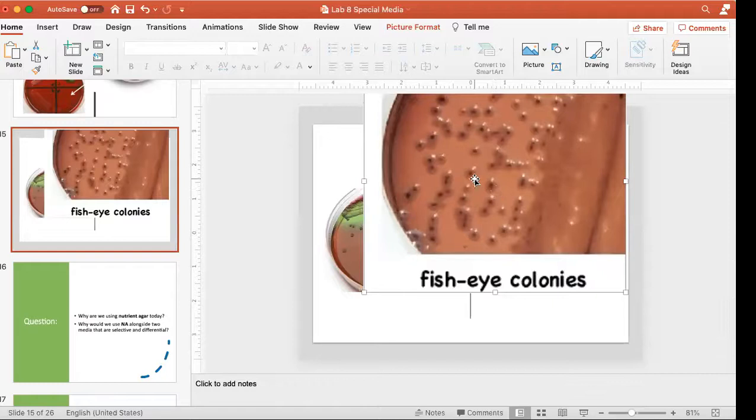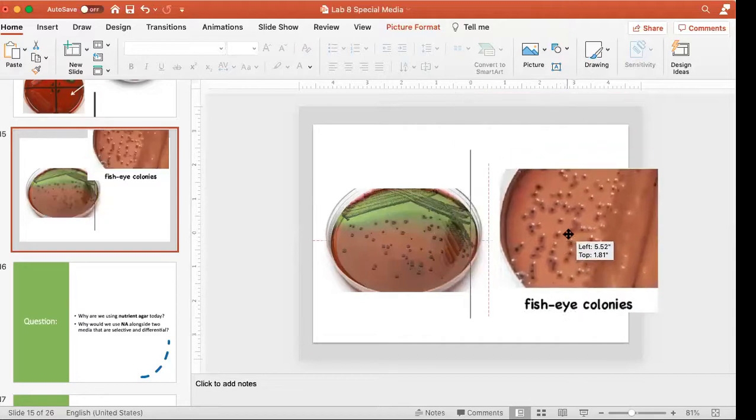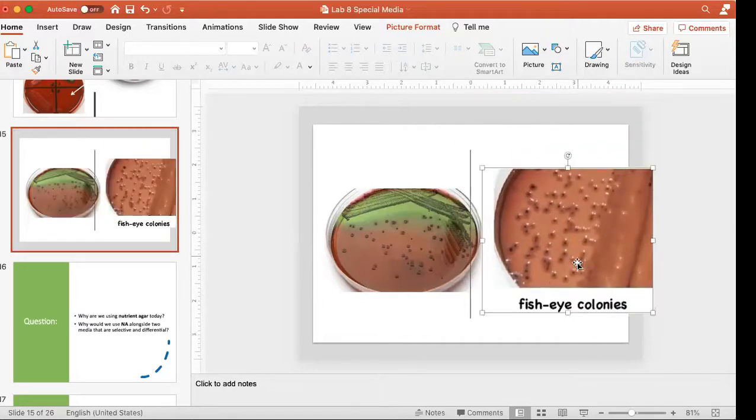I think you can just see it. All E. coli won't grow this way. Some does and some doesn't. But if you see it on a plate, you know, again, you've got E. coli. The green color tells you it's E. coli. And some E. coli grow with that dot right in the middle of the colony. Very interesting.